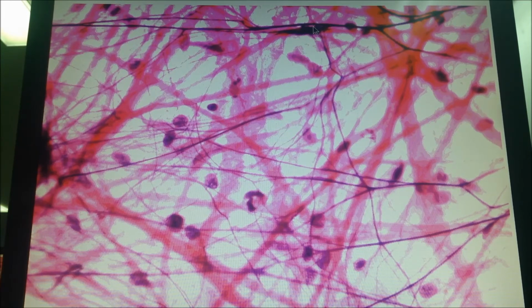راح تحكوا لي وين الreticular؟ الreticular is minimal، كثير صغير. It doesn't appear بهذا الzoom. You have to zoom a little bit more عشان تشوفه. So what you have in here is the collagen bundles and the elastic fibers. The cells over here، والله we pointed in any nuclei once again، شو بتحكي لي؟ This is probably what? A fibroblast. طبعا الmesentery هو الprime example على الloose connective tissue.